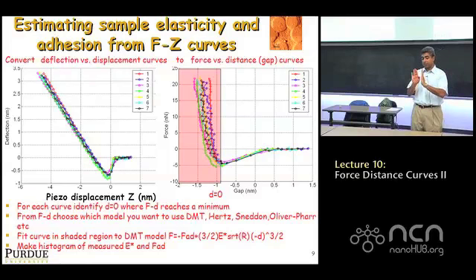So typically you take SEM images in two orthogonal planes, but high resolution, so like FE-SEM, field emission SEM images, and try to fit the radius of a circle to those images that you see and use that radius here. That's probably the best way to do it.